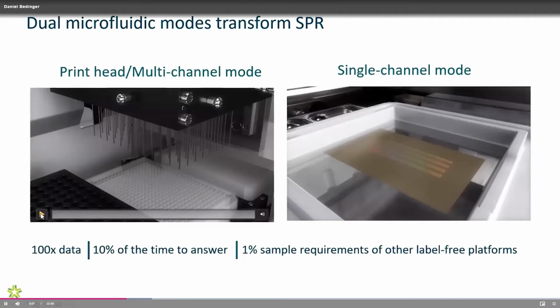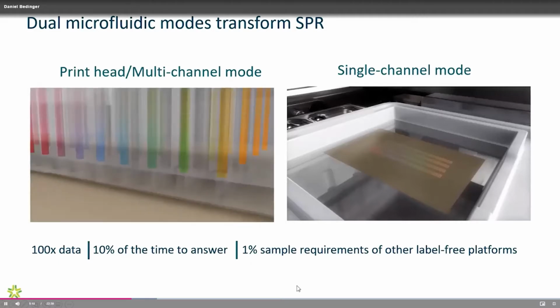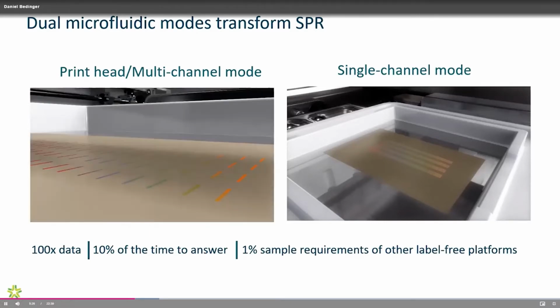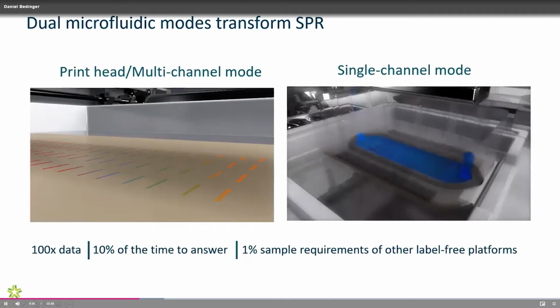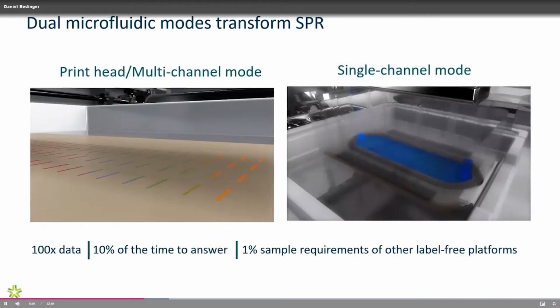So a real quick description of the system. As I said, it's an array-based SPR platform. It has two fluidic modules. One is a 96-channel side that can actually load or capture 96 samples at a single time and flow them back and forth across the surface to create your immobilized antibodies. And this can be done 4 times within an array to create a 384 spot array. Then the system has a single flow cell, which will dock over your created 384 spot array and flow 1 sample. So this makes either the kinetics or the epitope binning highly parallel in nature, where you're collecting data simultaneously from one 270 microliter injection volume to the entire sample set that's captured. And these two systems work in an automated way, so they can come on and off the surface to run things like capture kinetics assays.